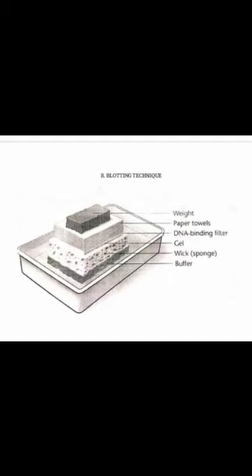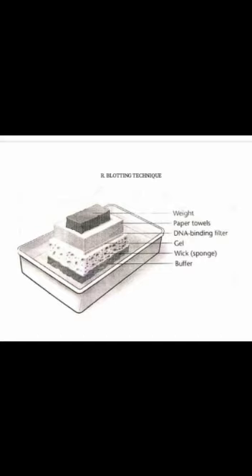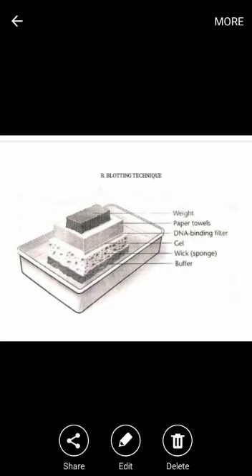And next one, applications of blotting and hybridization techniques. Southern blotting technique is widely used to find specific nucleic acid sequences present in different animals including man. For example, if we want to know whether there is a gene like insulin in sea anemone, then DNA of sea anemone is immobilized on a membrane or blotted by using an insulin probe against it.